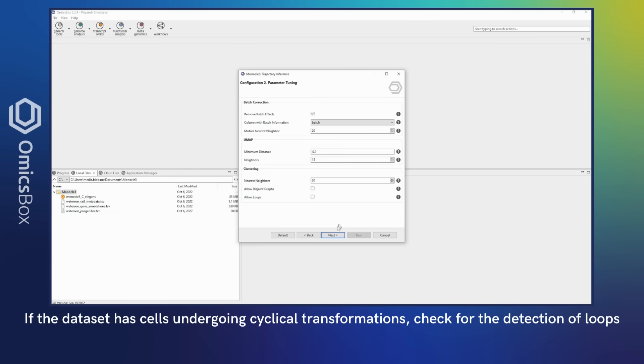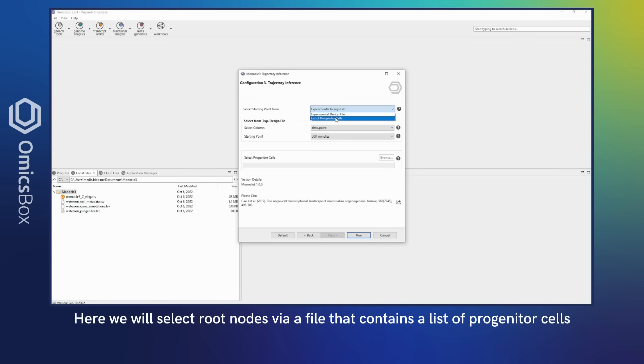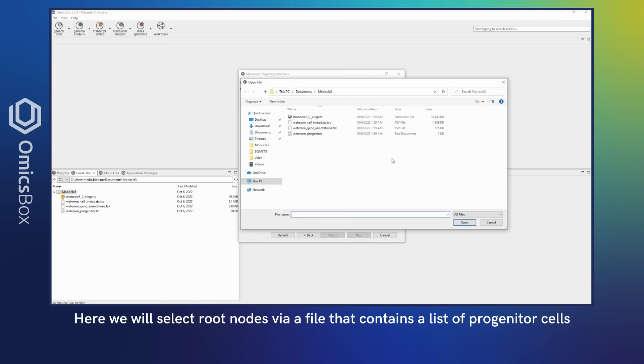If the dataset has cells undergoing cyclical transformations, check for the detection of loops. For instance, root nodes can be provided based on experimental information or via progenitor cells. Here, we will select root nodes via a file that contains a list of progenitor cells.